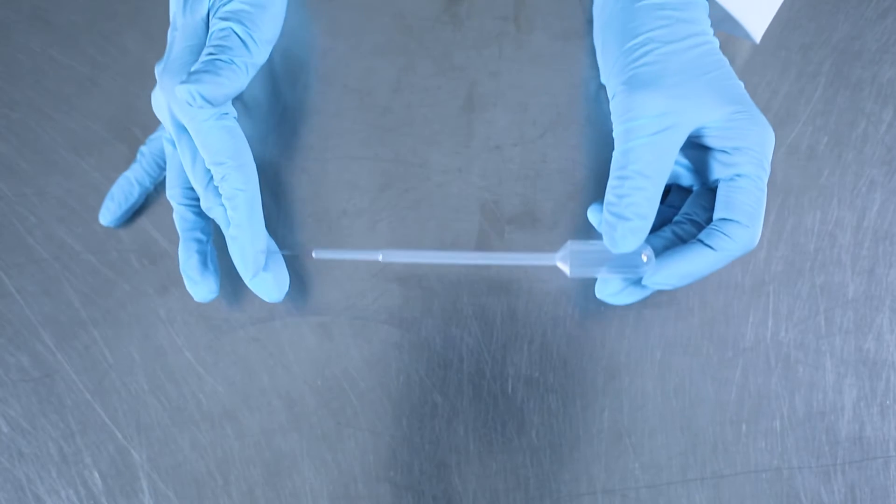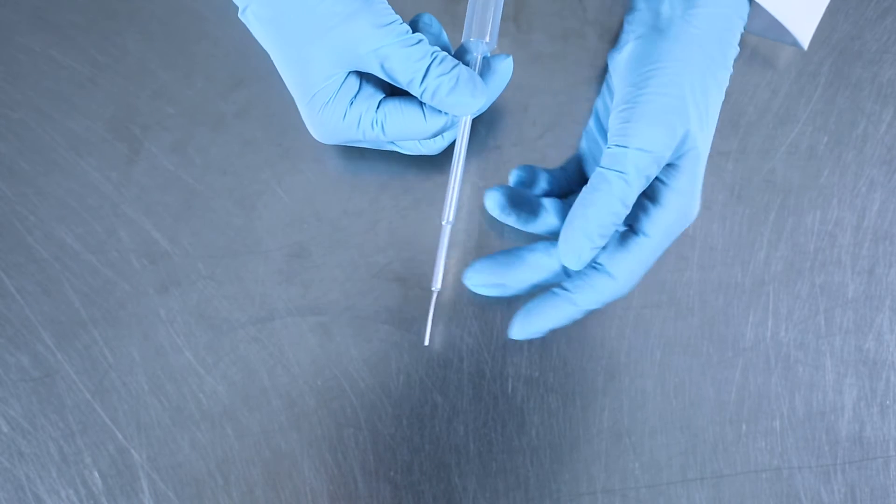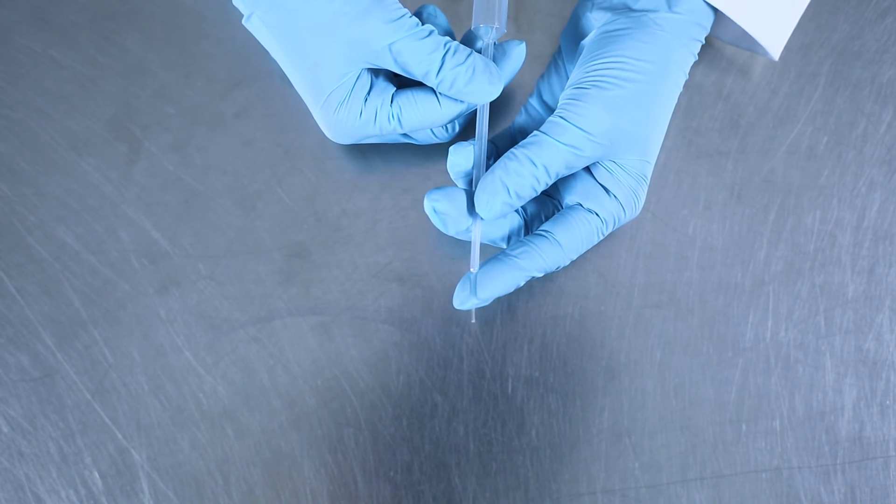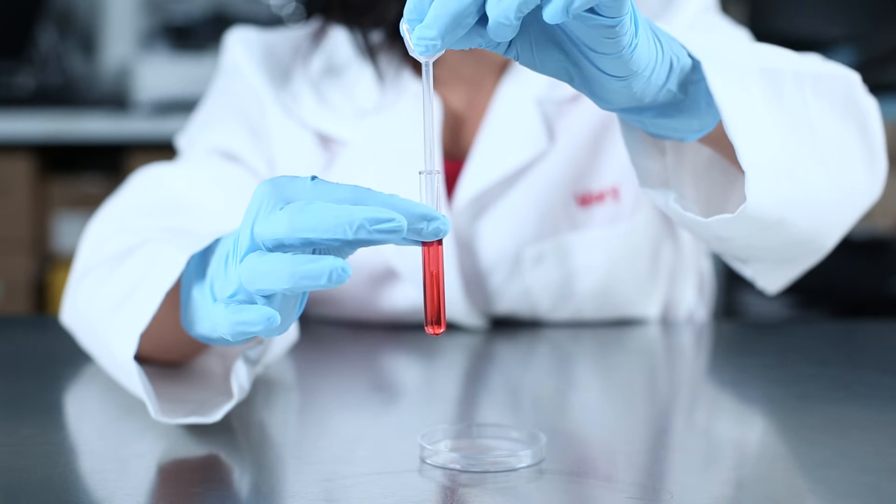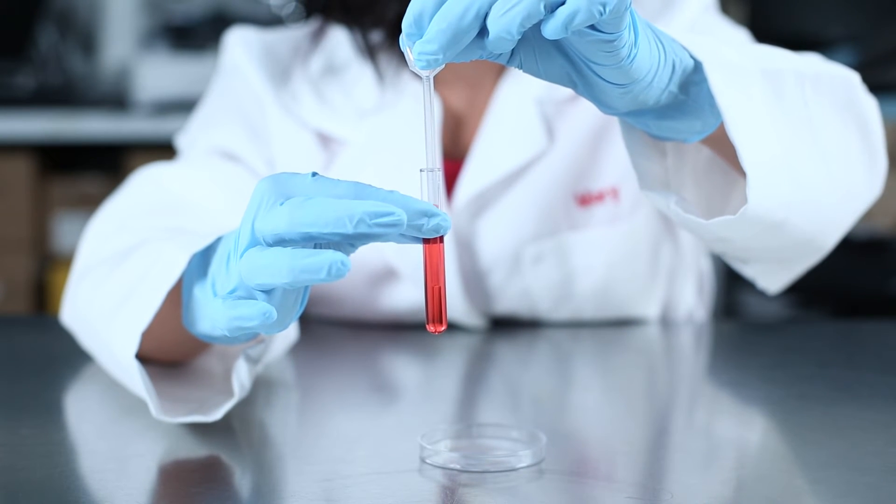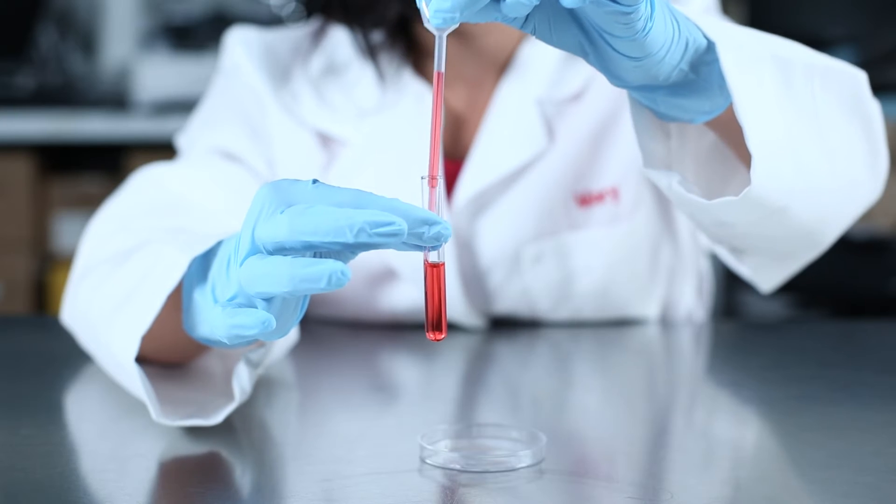We are one of the few manufacturers to make fine tip transfer pipettes that have a very small tip bore. Ideal for transferring small quantities of liquid or loading gels. On average, a fine tip bore is about 0.05 inches in diameter.